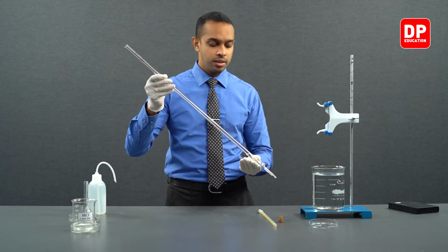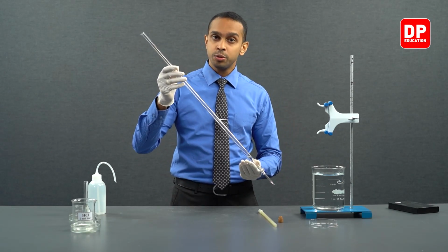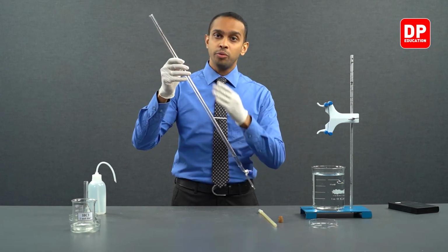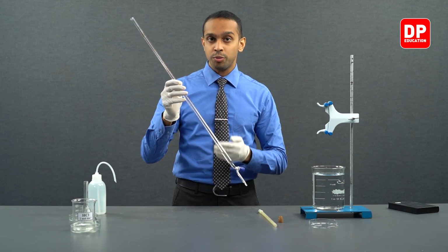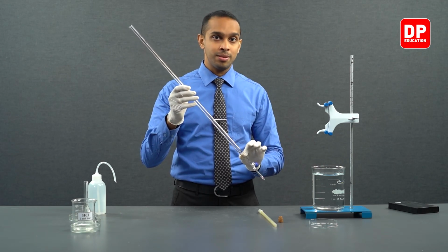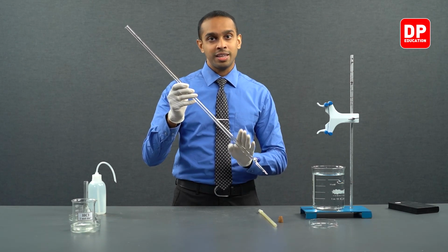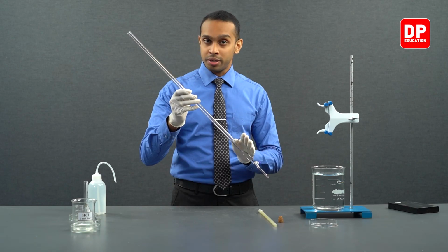After transferring our 5 milliliters of HCl, we have to add distilled water into this burette all the way to the top. When we are doing that, we have to make sure that we do it in such a way that the HCl layer does not get disturbed that much, because we do not want the HCl to get mixed with the water at this point.